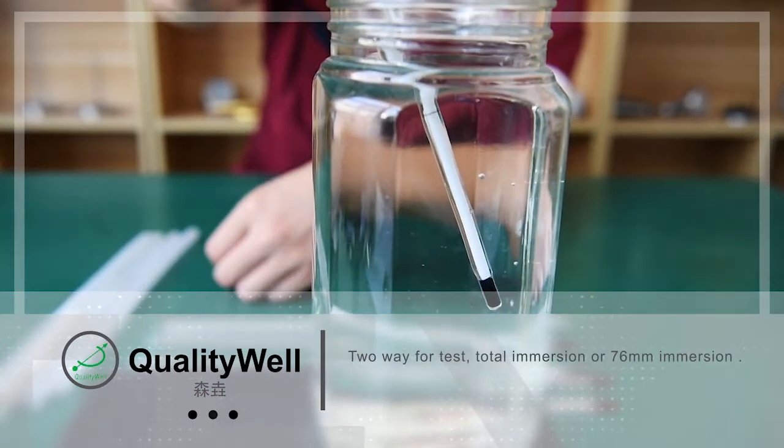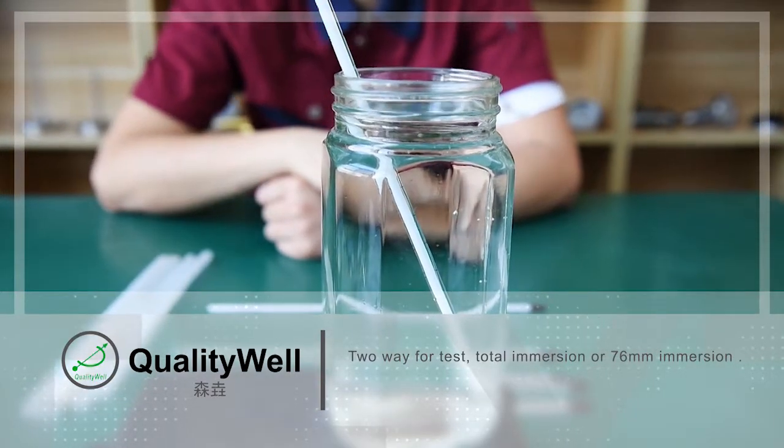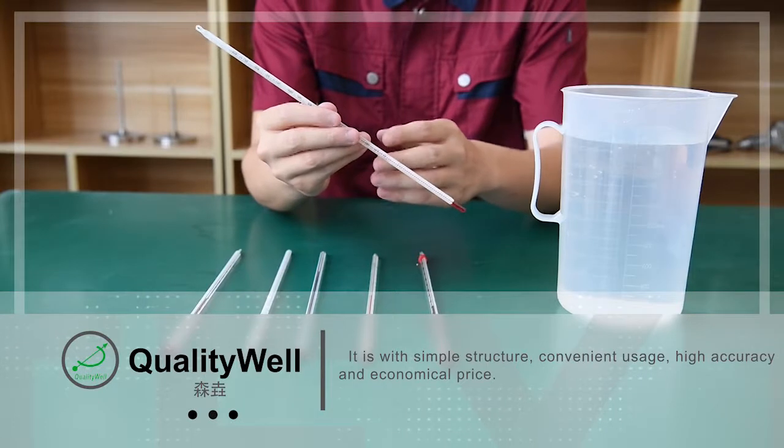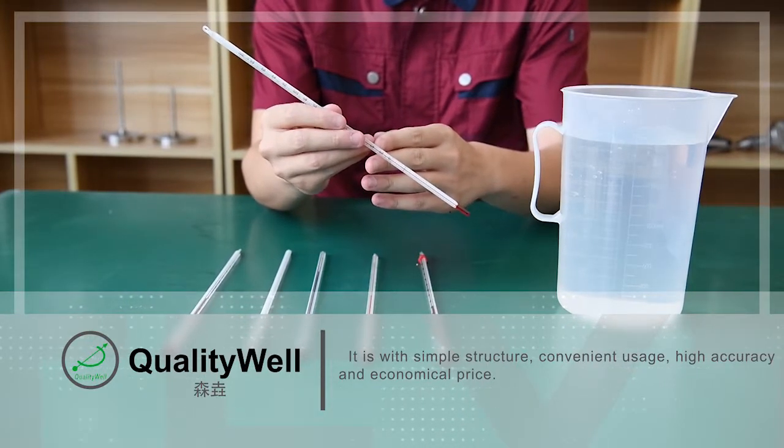Two-way for testing: total immersion version and 76mm partial immersion version. It is with simple structure, convenient usage, high accuracy, and economical price.